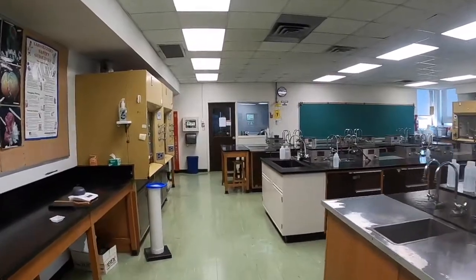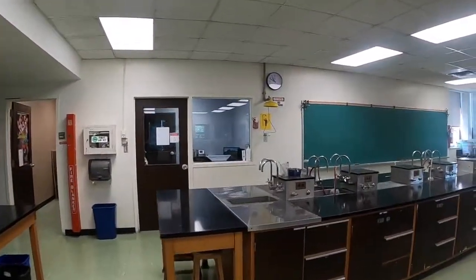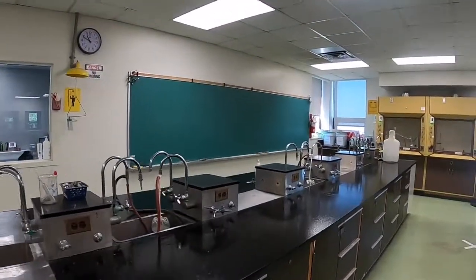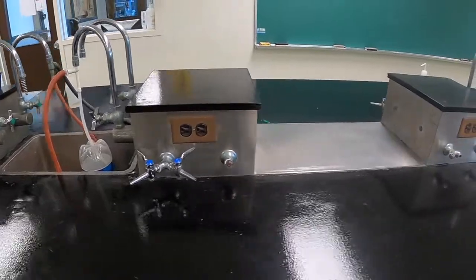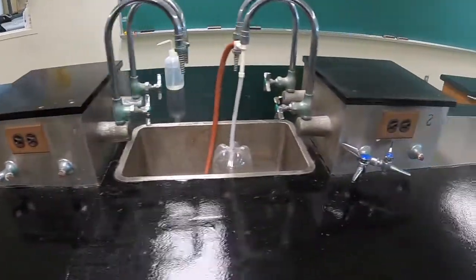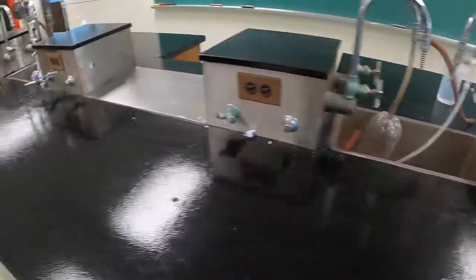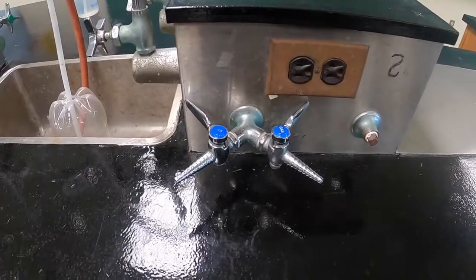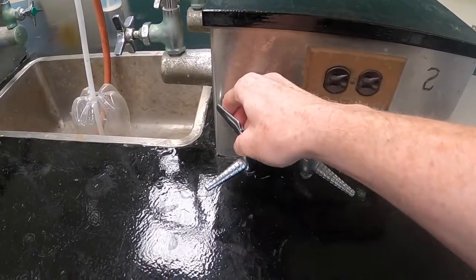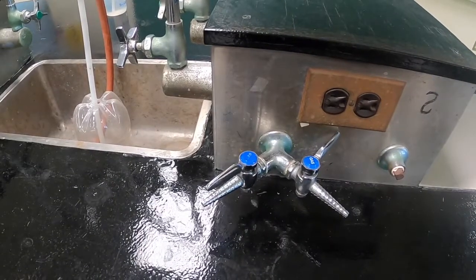In the event of an emergency where we have to evacuate the lab, you always want to shut down any experiments you're working on before you leave. This can include things like turning off appliances like hot plates, or shutting off the propane we use for our Bunsen burners. If you look along the benches, you should see propane bench valves, and you want to shut these off by turning the handle towards the bench. They can be quite stiff to turn, so give it an extra little twist to confirm that you've got it all the way shut.